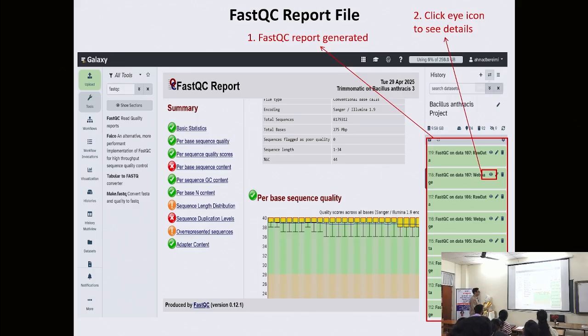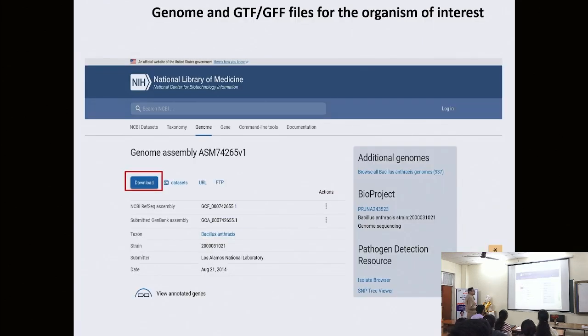Okay, so good quality sample. It is important that you have good quality samples throughout, otherwise your results would be influenced by bad quality bases. So it is important for you to assess this. Once FastQC is accomplished, the next step: these FASTQ files have reads, and these reads have to be mapped onto the genome, right?